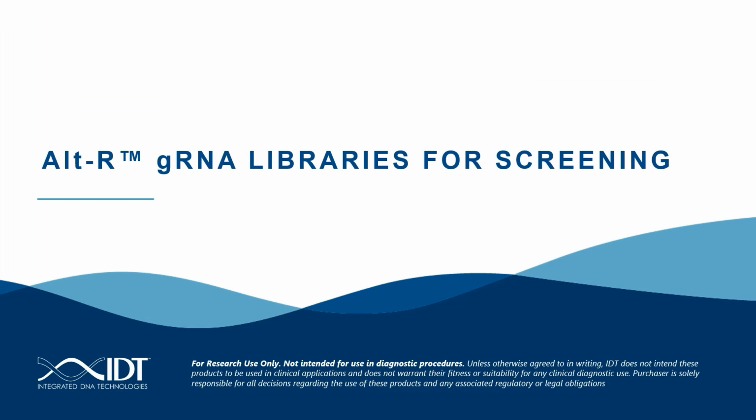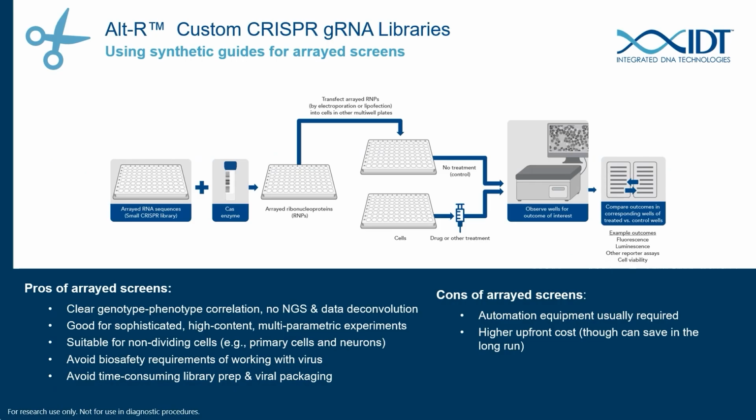Next, I am going to provide a brief overview about the array-based gRNA libraries that are offered by IDT for screening purposes. For CRISPR screening using the arrayed crRNAs, these individual crRNA sequences targeting different genes are kept separately in different wells of a multi-well plate. These RNAs are then combined with Cas enzymes to form the RNP complexes, followed by the electroporations into the cells in individual wells. CRISPR genome editing knocks out different genes of the cells in different wells, and the edited cells will then be treated with either drugs or other stress conditions for positive or negative selection purposes. Observations of the changes in a known phenotype or response in different wells of the cells is used to determine which genes are involved in the physiological effect being studied.